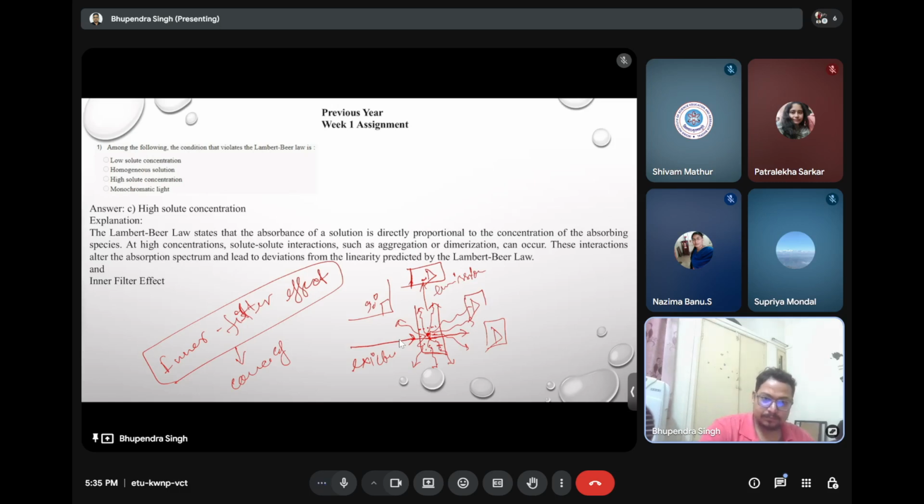This is also 90, and this is also fine. So why not here? Because emission is everywhere, directionless, even if you collect at 90 degrees, 45 degrees, 75 degrees, or just here at 0 degrees, no problem. Even if you have not studied, just think about it. Why?